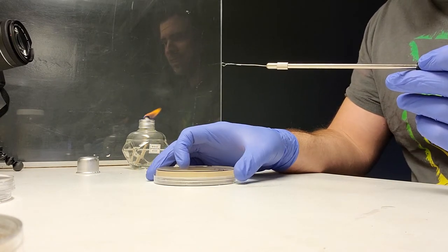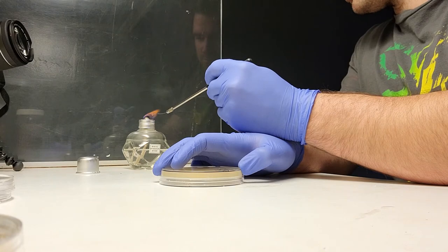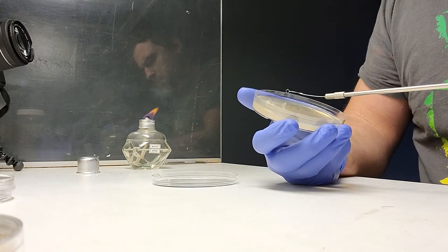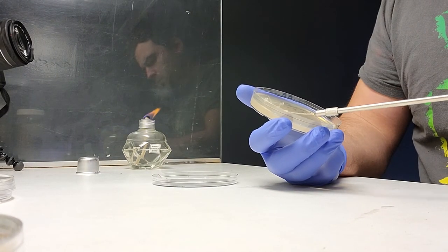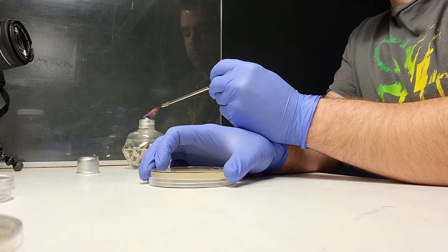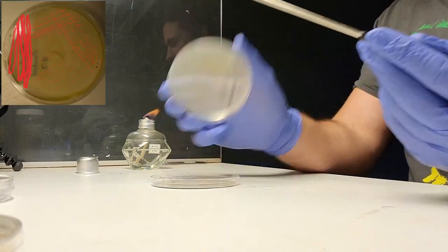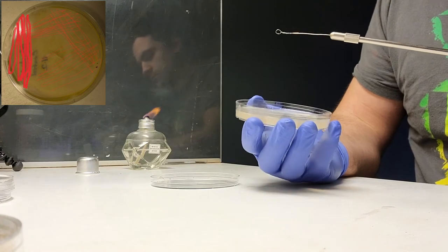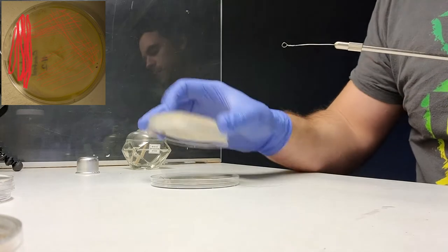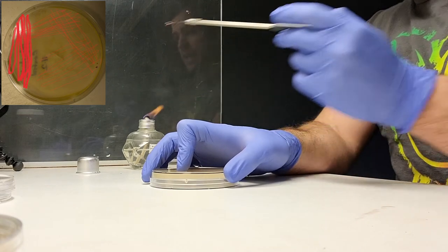That didn't work — first time with a new loop. I've got to do it again, being more careful. I'm going to show you this streaking pattern. Here I go again — I'm angling it in the light so I can see where I've already been across, and I'm going to do this three times.